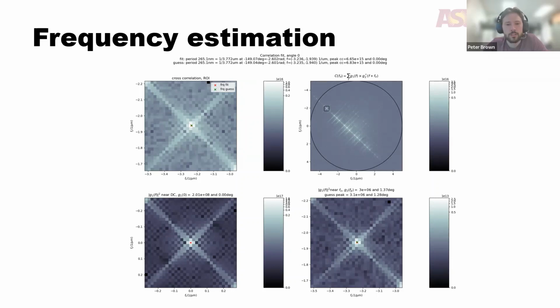So we've implemented this in our mcSIM package, and here is a diagnostic plot that we show, illustrating a typical cross-correlation pattern in this upper right figure between our two shifted bands.